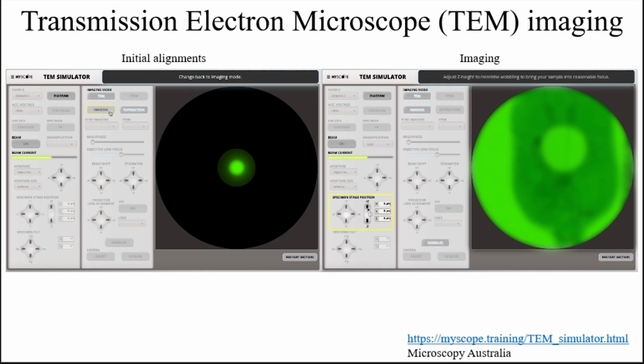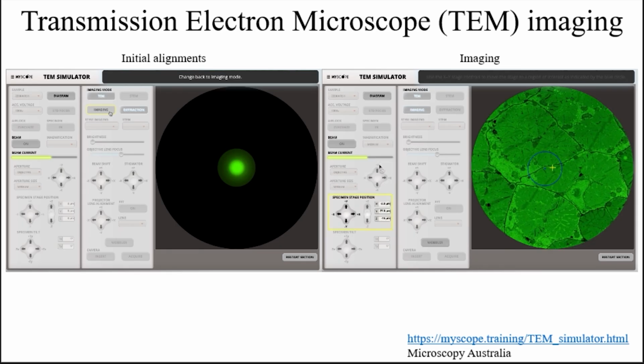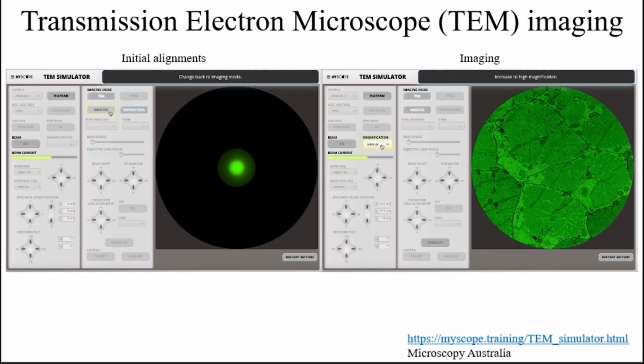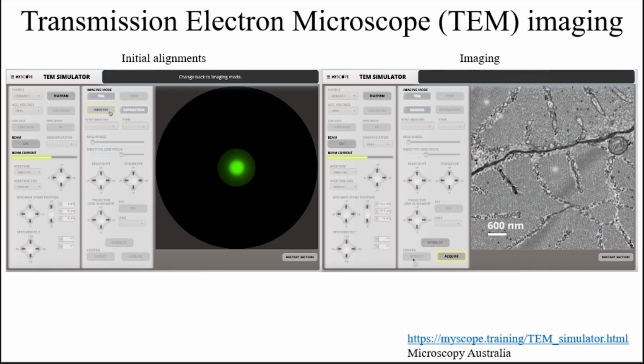This is needed to set the height of the microscope, the height at which your image is. You are moving the screen, and then you go to your area of interest. The scale here is in nanometers, and you have to move very carefully. You can't move the whole slide here and there. You saw that small support, right? That is what you're moving. So I'm seeing in the nanometer scale. That's how you take an image.